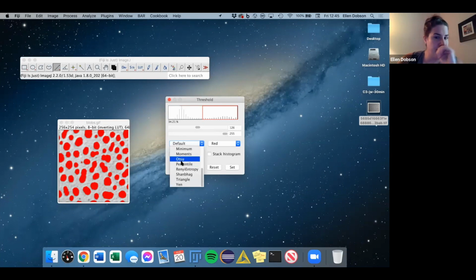For example, Otsu is the go-to one for round, good signal to noise type images. So it's really good for DAPI staining for isolating nuclei. Otsu is good. The default of ImageJ is actually based on Otsu. But you're like, okay, so which auto threshold do I choose? How do I even know? There's a whole menu. I have to go through each one and look at them.